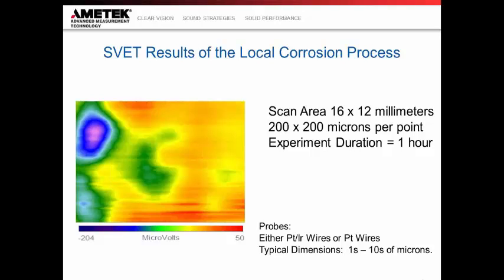So those are some uses of this applied gold test sample, and that's a very good tool to use to start learning how to do these experiments and how to prove them to other members of your team. But how do we take that knowledge in that training session, and how do we use this in a real type of experiment? So I was sent to our demo lab.